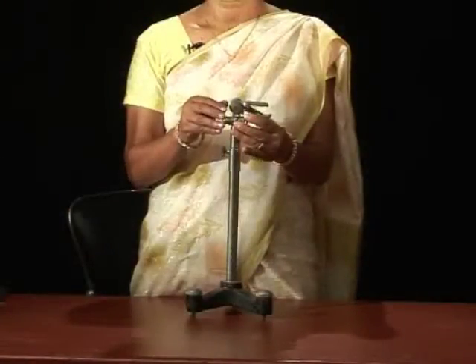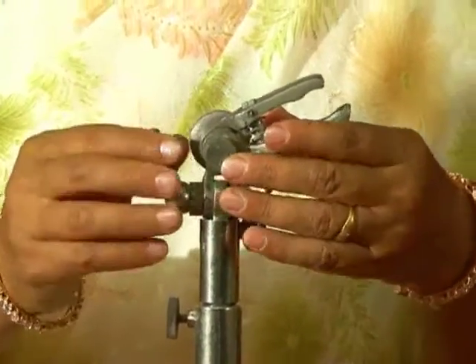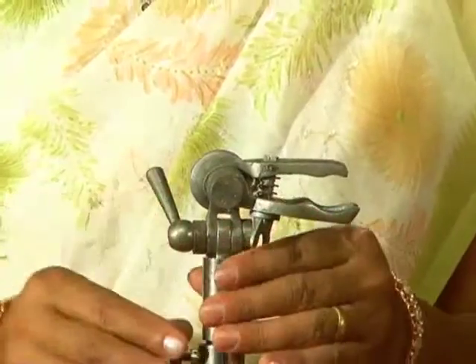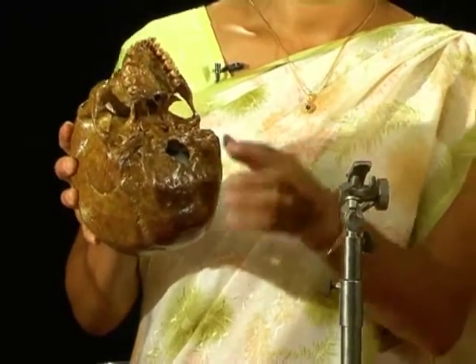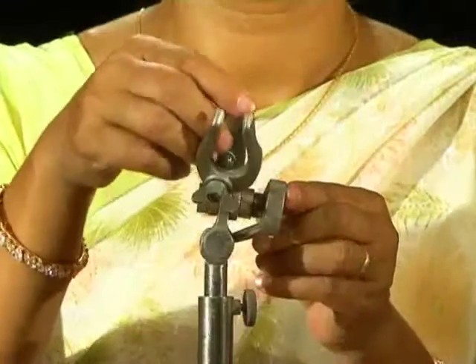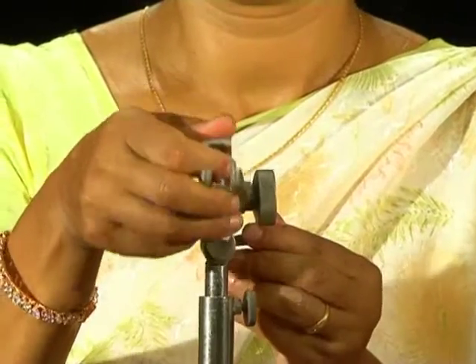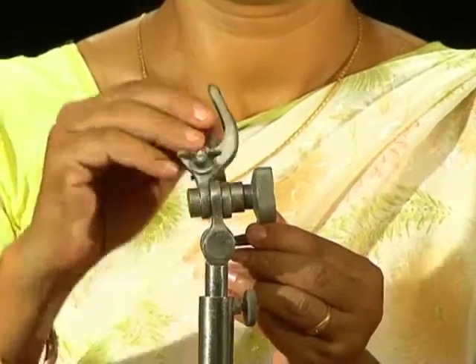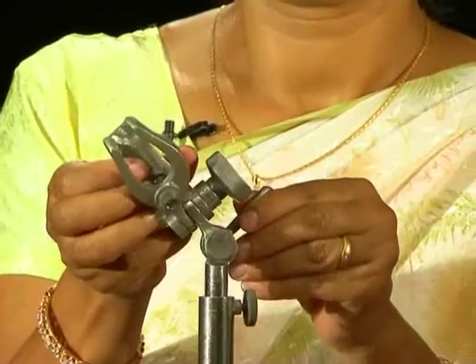The top of the inner tube bears an adjustable jaw-like structure, that is, the skull holder, to which the skull is fitted at the foramen magnum. The jaws can be moved in 2 directions, that is, forward and backwards, as well as from side to side. Prior to its fitting, it can be rotated in all directions.